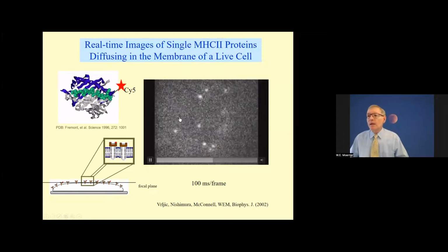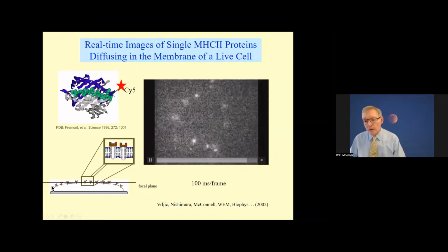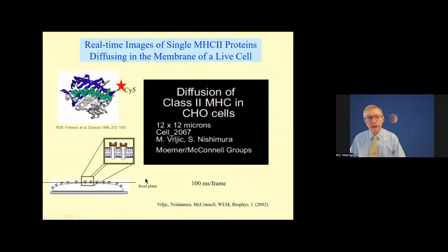You also see them getting a little bit larger in size in terms of the size of this spot. That's when the molecules are out at the edge of the cell and moving out of the focal plane of the microscope. So many things present in this quite old movie. I like to show it again and again because that's really interesting and fascinating behavior. Well, watching motion is one thing that you can do, but measuring positions is another thing that you can do. So two different kinds of experiments are going to be contrasted here in my discussion. But the behavior that I just showed you was motion, was molecules moving in the membrane.